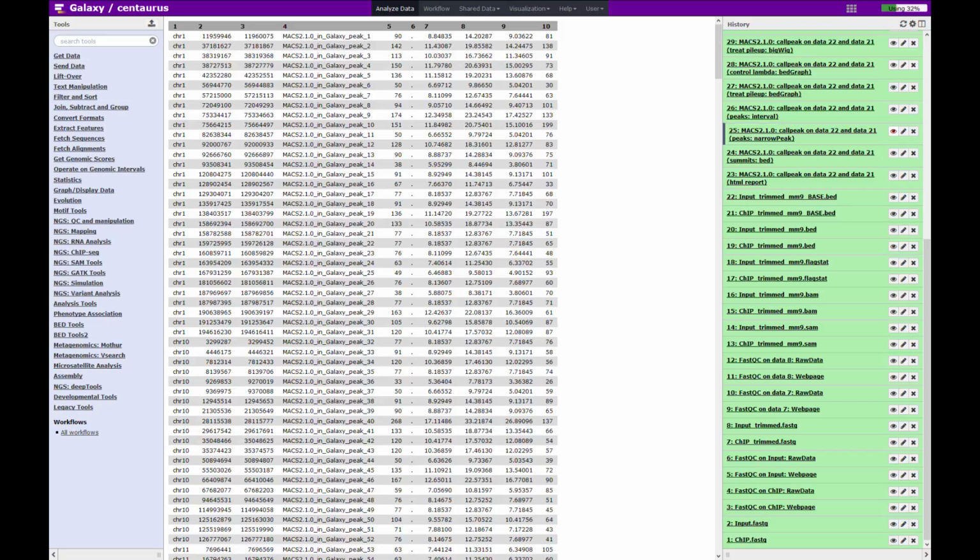There's nothing else we need to do with this file in particular, apart from that it is useful to display on genome browsers such as the UCSC browser.